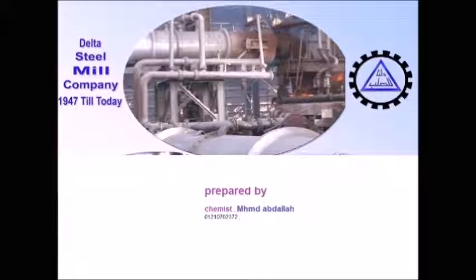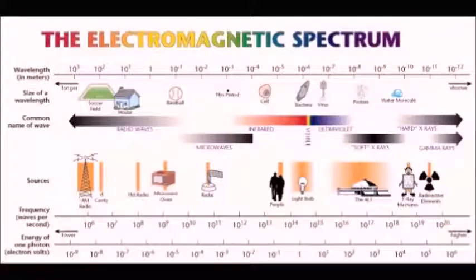Today I'm going to make a presentation on how to use optical emission spectroscopy to determine quantitative and qualitative measurements for solid samples based on iron. First thing you should know is the theory of atomic spectroscopy, then the instrument components and how we introduce our samples. So what is atomic spectroscopy and how does it differ from molecular spectroscopy?